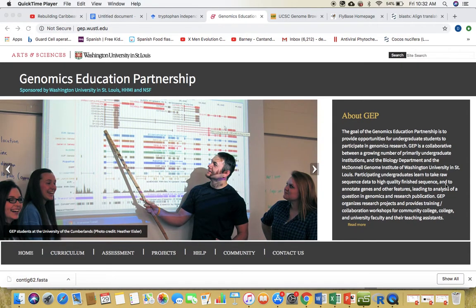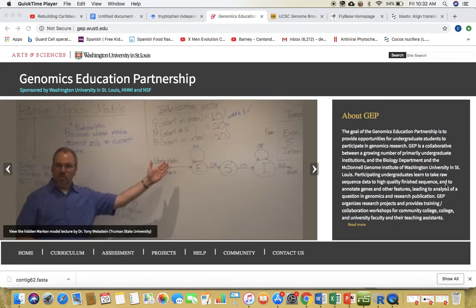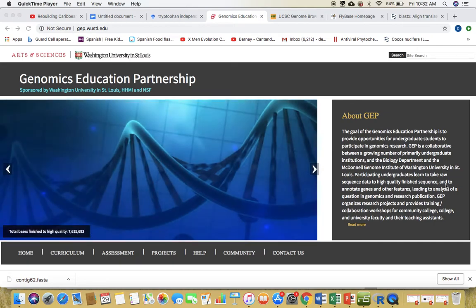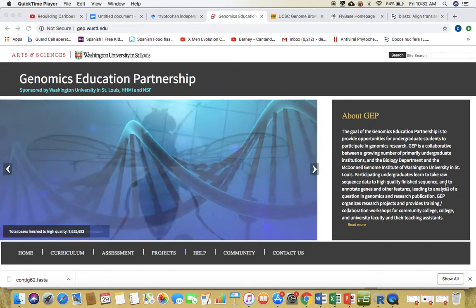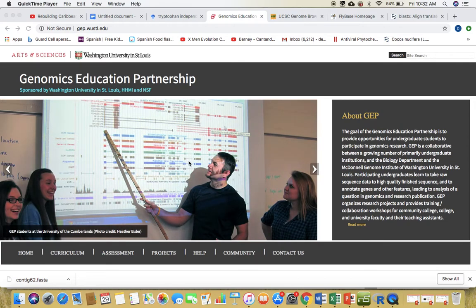Hi everyone. I'm going to go through an actual annotation of a Drosophila species Contig feature, and I'm going to use this to enable you to see how you could navigate through these different databases to annotate your feature. There are certain sites that we'll be using a lot. I have these sites open right now.